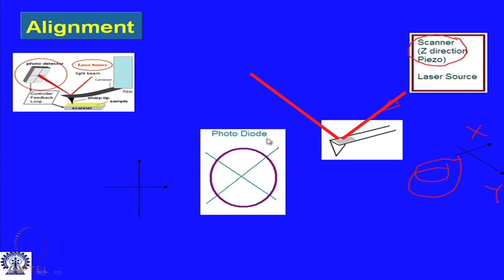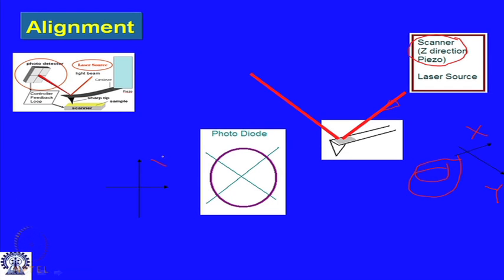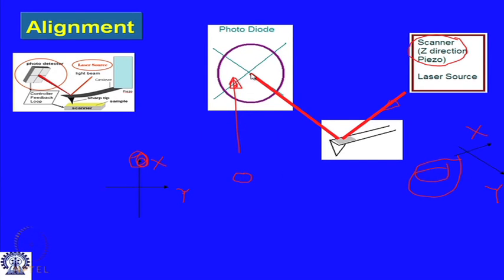You now have the position sensitive photodiode, and again you have two sets of screws over here for the x and y motion. You need to turn them so that the photodiode shifts to a location where its center is in a position to accept the reflected laser beam. So, you shift it in this direction, so that this is the location. We have already talked that this is a perfectly aligned atomic force microscope now.